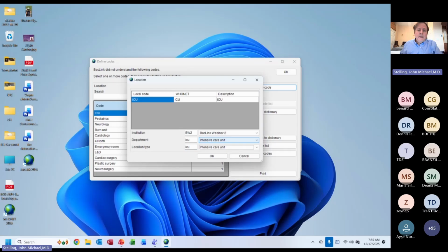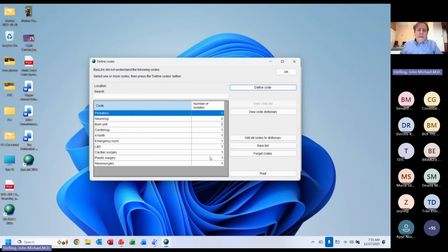There's the medical ICU, the surgical ICU, the pediatric ICU, the neonatal ICU, and burn units. Burn units are usually considered a kind of ICU. Okay. So I do not have to do this, but it does allow me to put that valuable information, inpatient, outpatient especially. And if you do want to standardize medicine, surgery, farm, clinic, then it's useful to be more comprehensive.